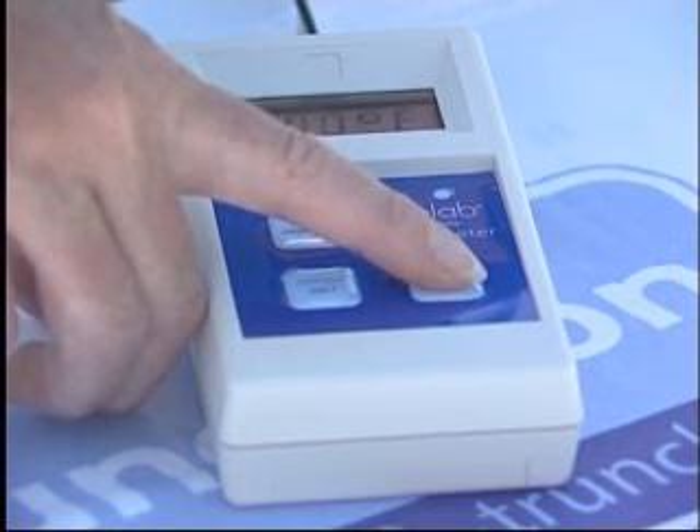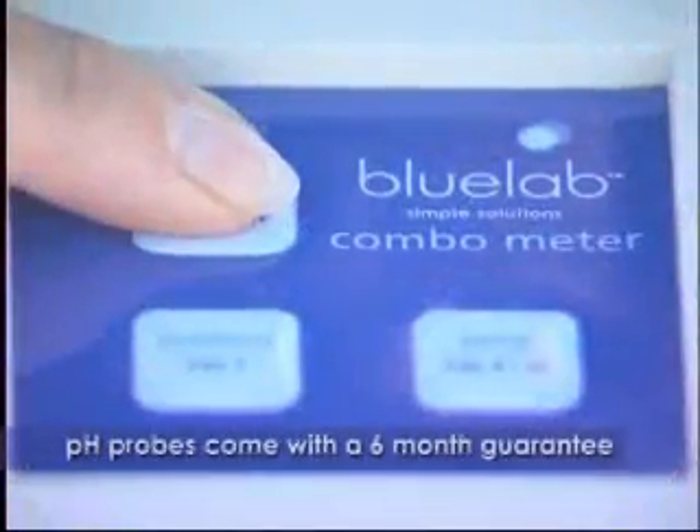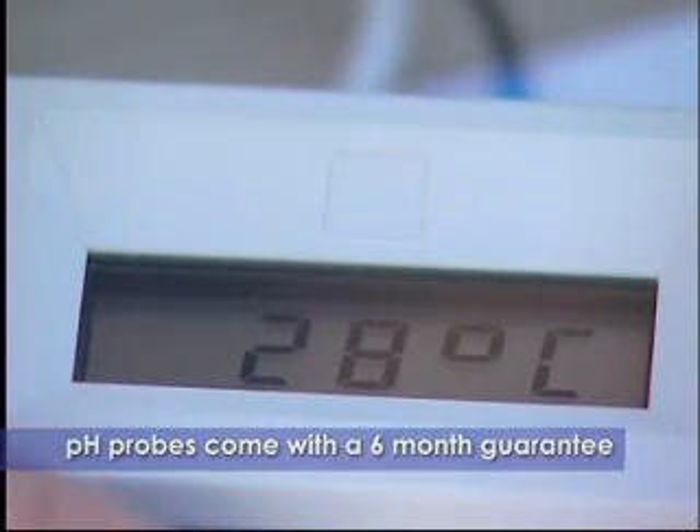It is easily calibrated and comes complete with the conductivity, temperature and pH probes. Calibration is a simple push button system and it has a 5 year guarantee. The simple LCD screen allows the user to see only the reading they are trying to measure and nothing else.